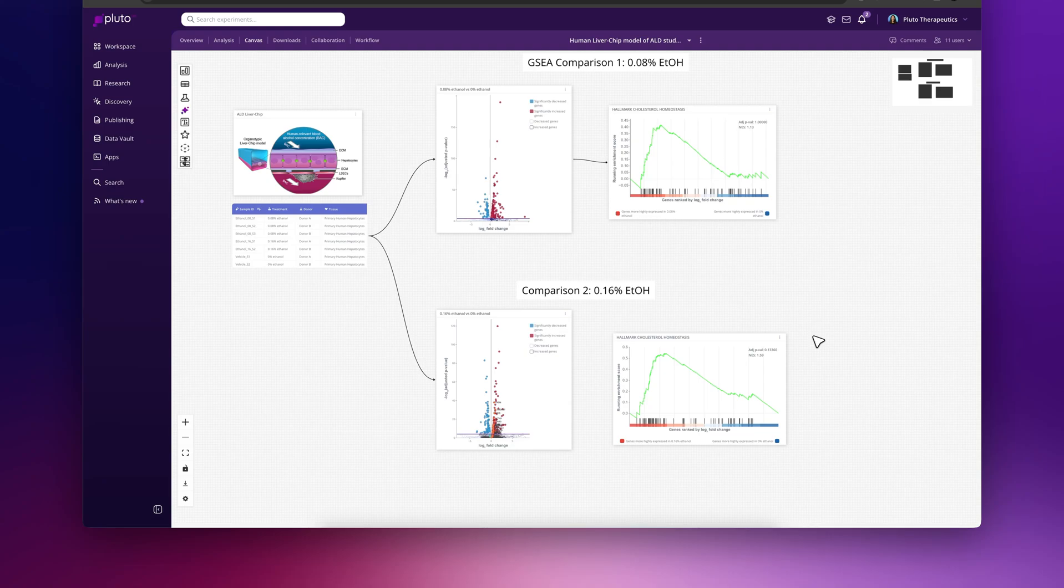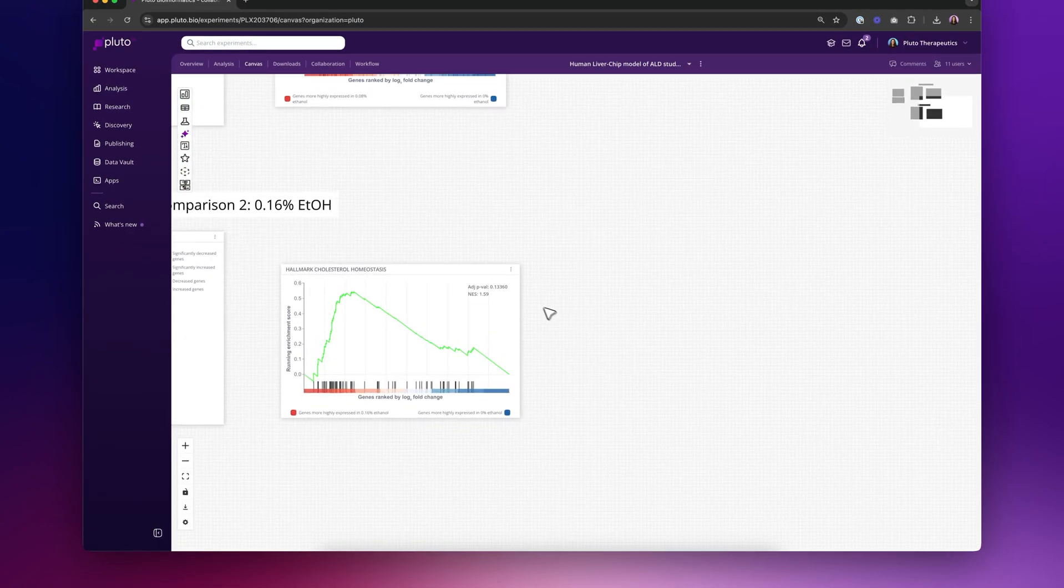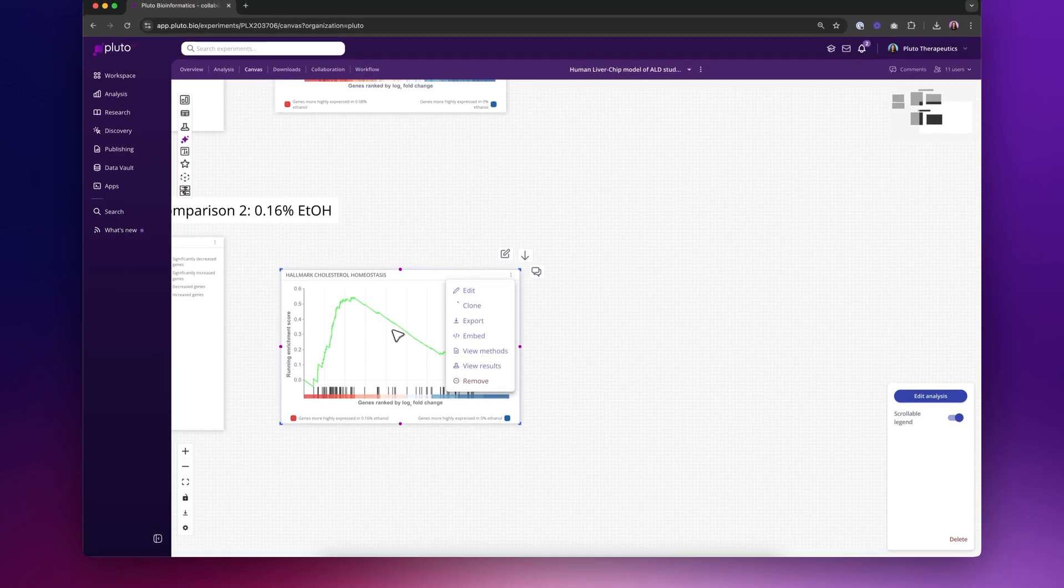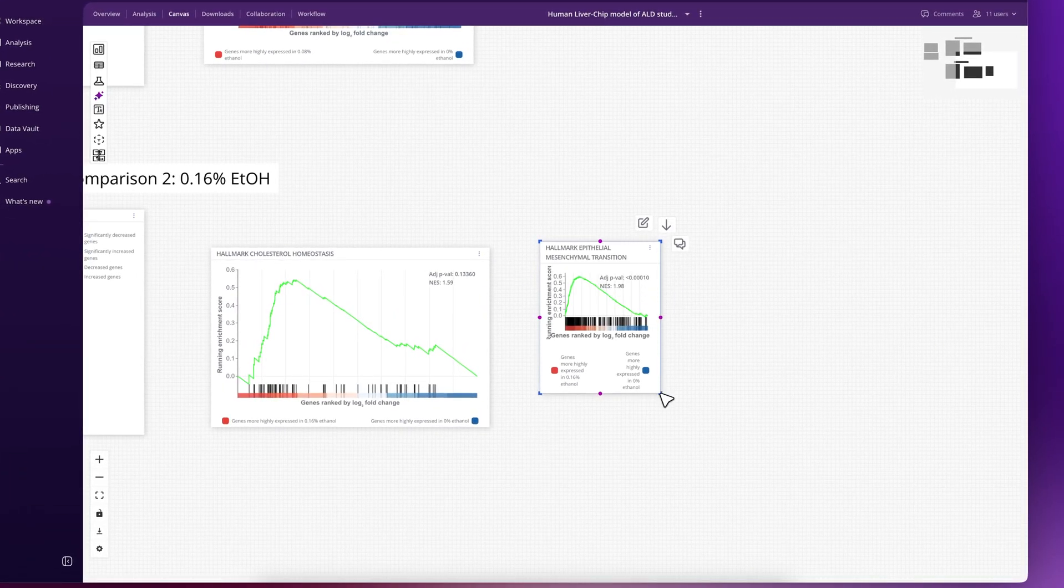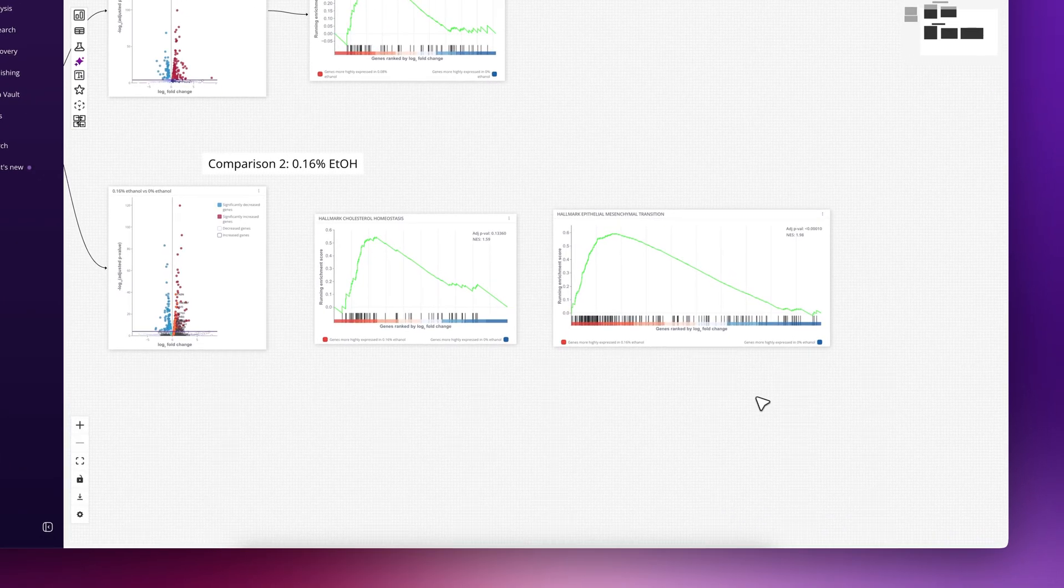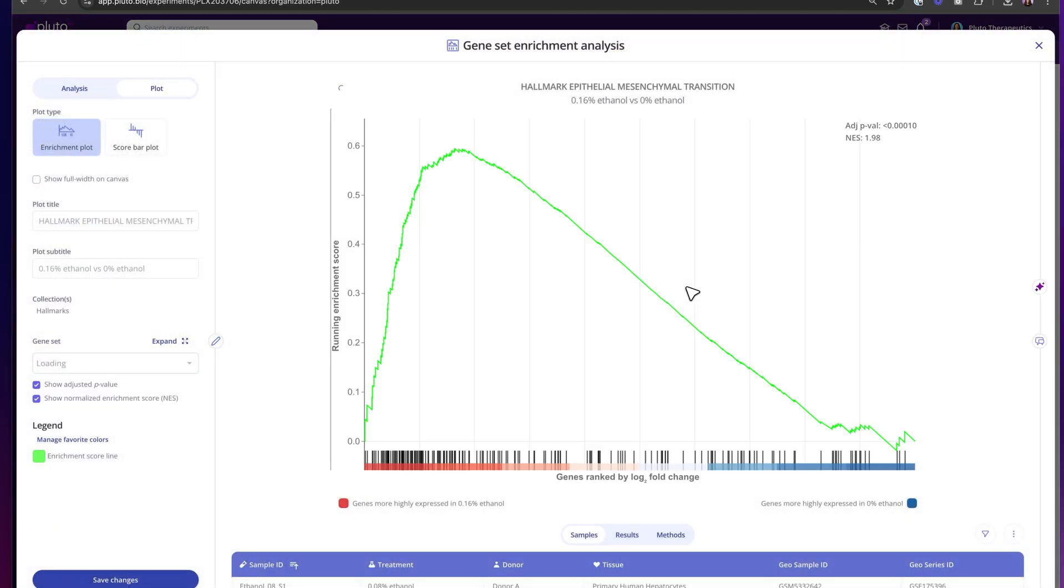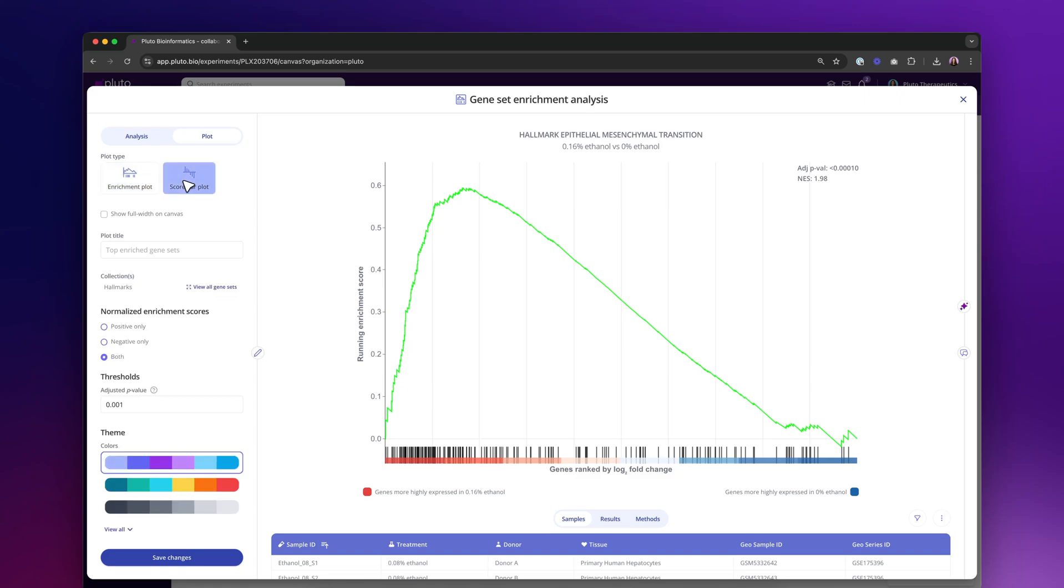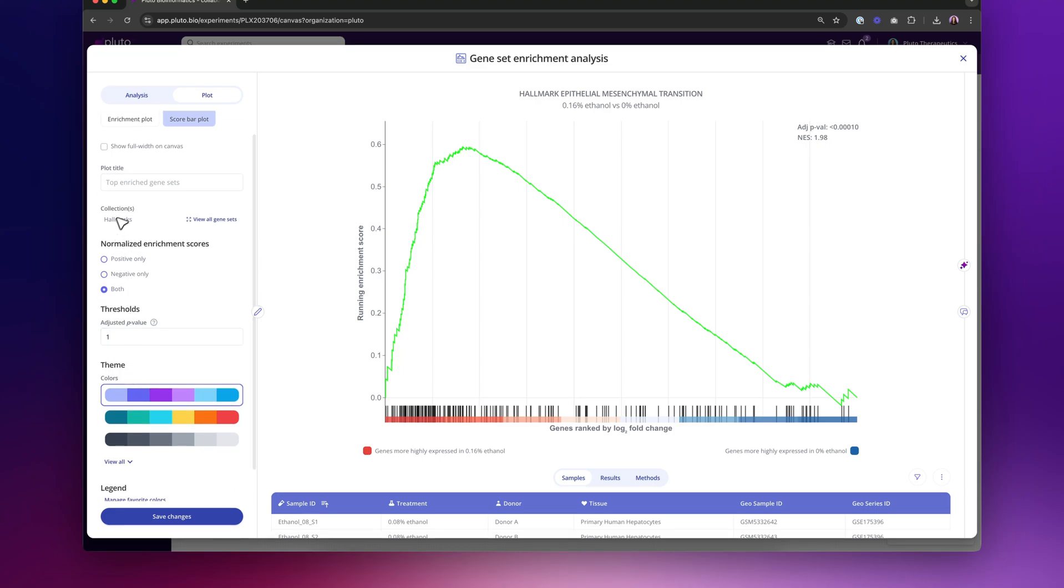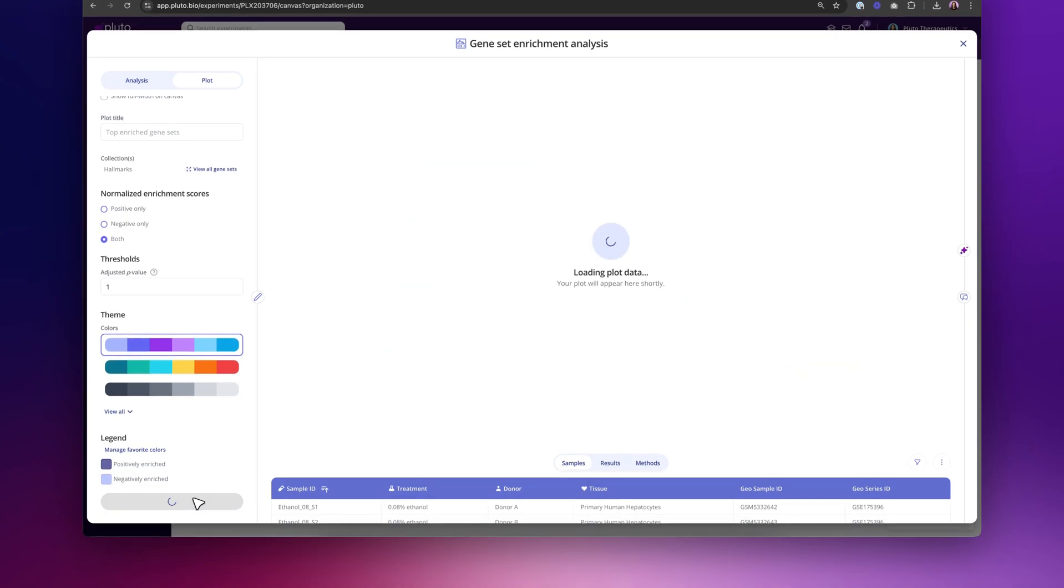With GSEA, you may also be interested in looking at multiple pathways at the same time. And so another way to visualize this result is by using a score bar plot. A quick way to kind of clone this result and then visualize it in a different way is using the clone feature here that I just used on the canvas. So now I have a second plot that looks very similar to my first one. This is showing the EMT gene set again by default. But I can come back in here and then on the plot itself show the score bar plot instead. So here what I'm going to do is actually change the adjusted p-value just to 1 so that I'm going to be showing all 50 gene sets in the Hallmarks collection. And I'll click save there.